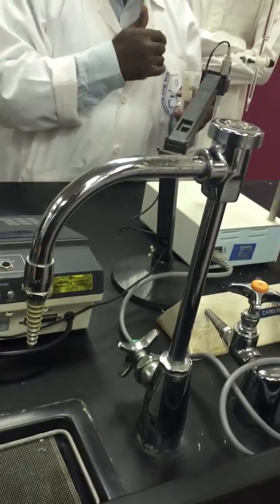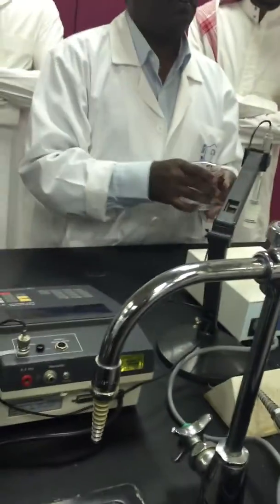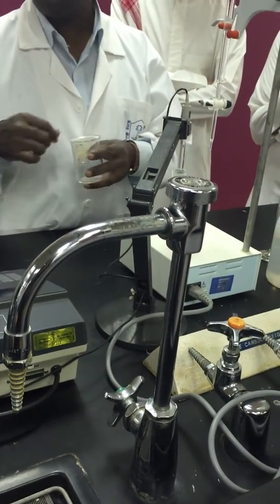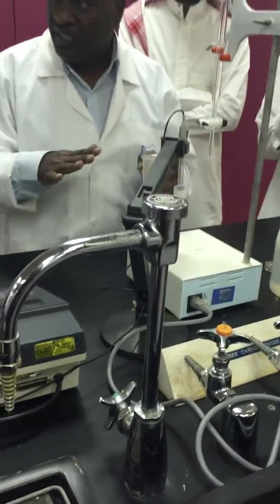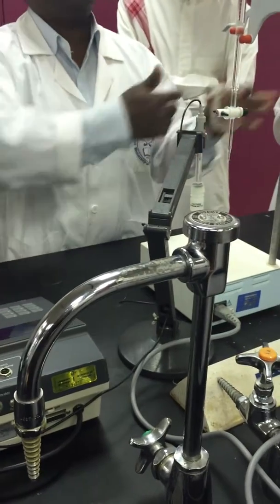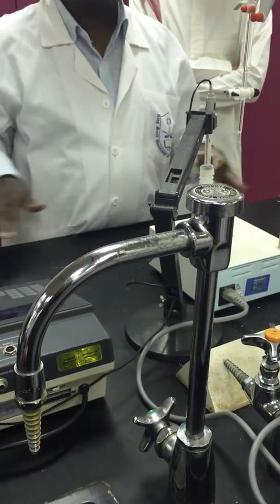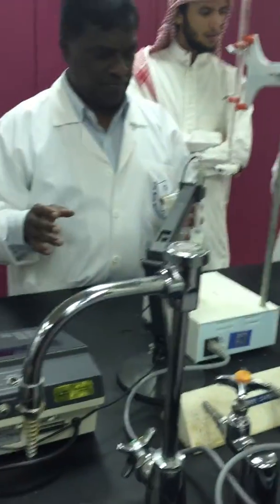Try to rinse, especially this one, because maybe some student used it before, put acid here, and did not wash properly. So when you come, you rinse and wash and use. Also after finishing, you have to wash and clean your area and go, because another student will come. This is part of the exam.